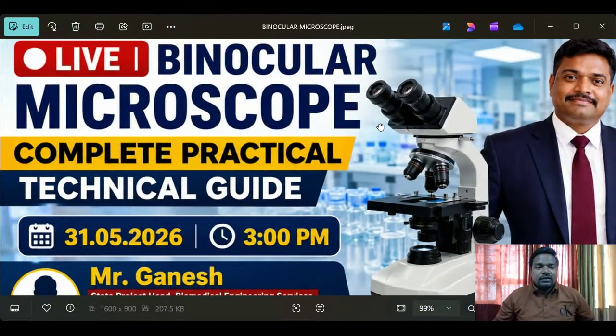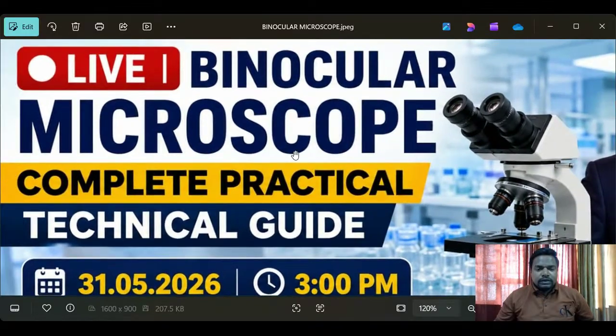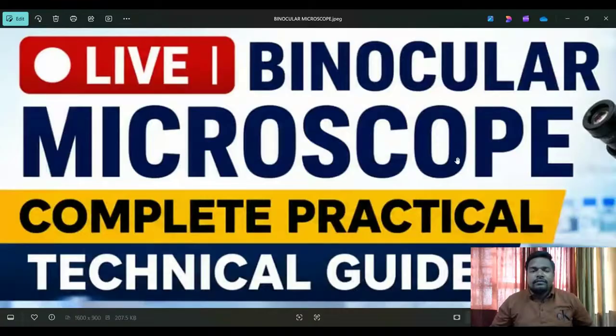See here, first of all, now I'm going to zoom in so you can understand and see it very clearly. Binocular microscope, complete practical technical guide.